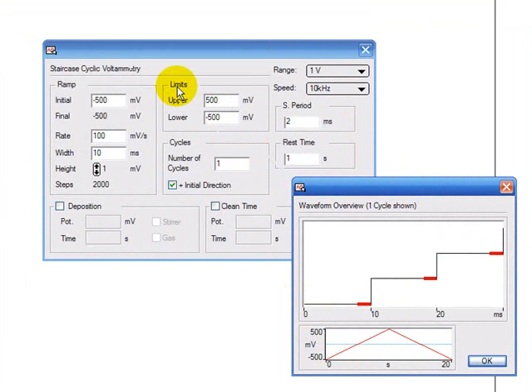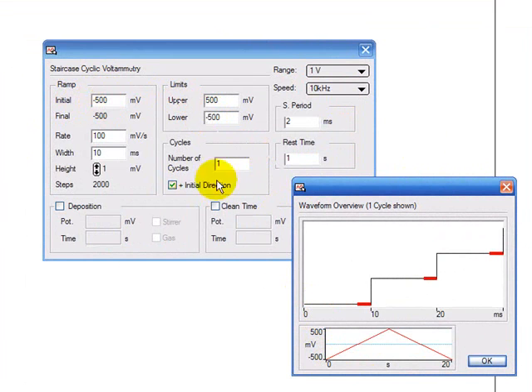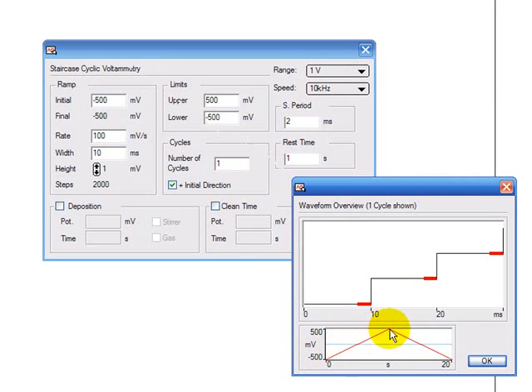You start with the limits, so the upper limits, lower limits and the initial voltage here. So the software is going to start at minus 500 millivolts, go up to plus 500 and then back down to minus 500.